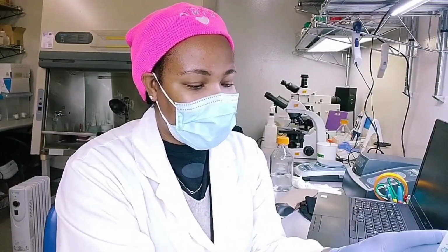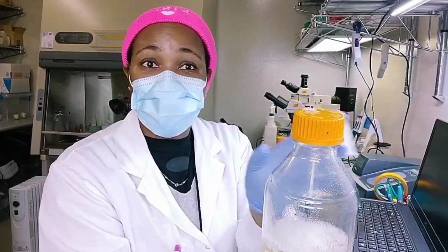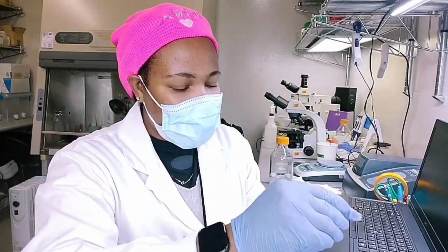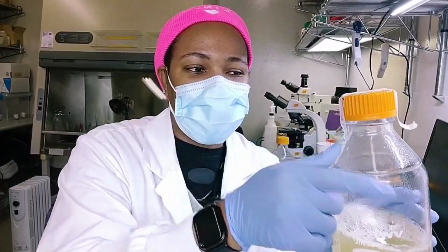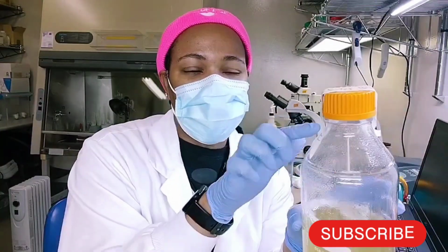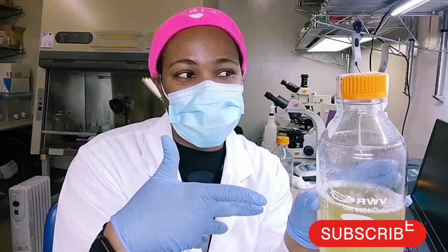As a standard practice, what I like to do, so right now it's screwed very tightly, but before you autoclave it, you gently loosen it, not too loose, but just enough so that the air can escape and doesn't build up and explode. Then I like putting my autoclave tape across the lid and the neck. It sort of holds it in place, and also I can know if someone did open it, because then they'll have to break this, which is almost like a seal.